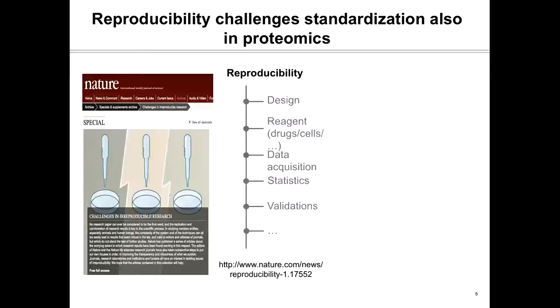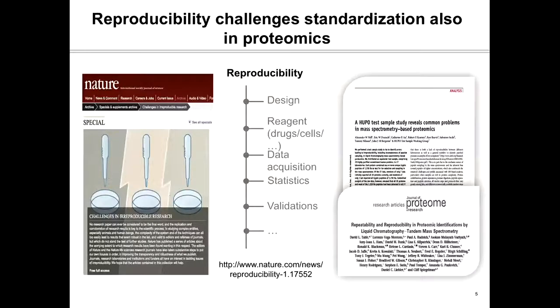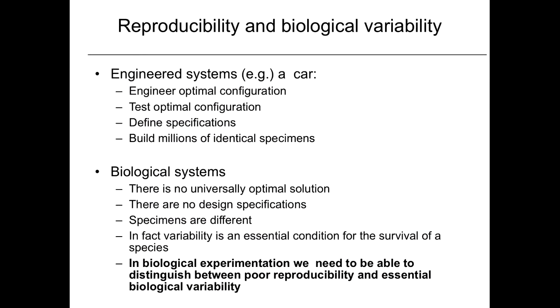So I will come back to some of these points throughout, because I think in proteomics we have made some progress, fairly significant progress, in some of these areas: the data acquisition, statistics, and validation of data sets. We can confidently say, if someone is doing an experiment competently, that the results are quite reproducible. And we'll show some results of that. And then there are a number of journal articles that address this issue.